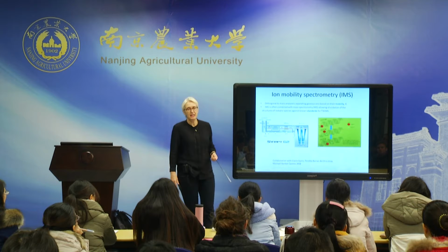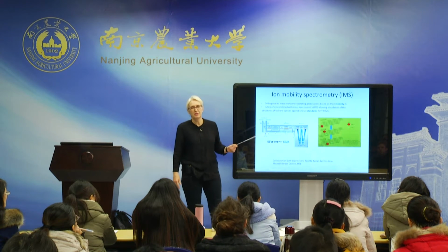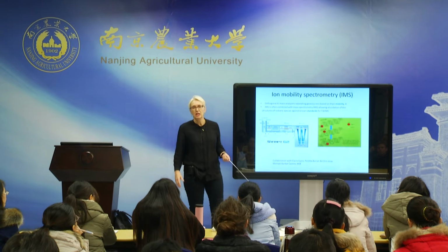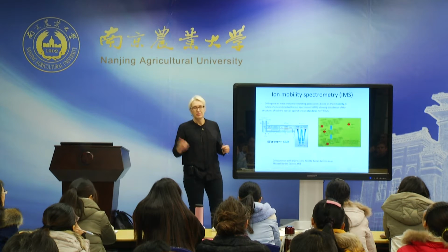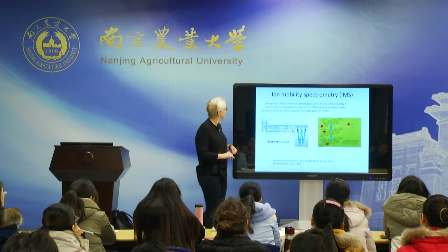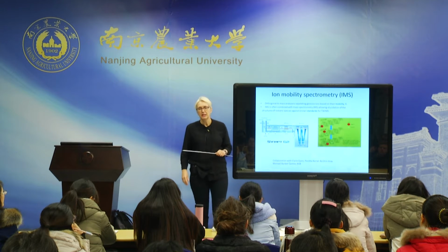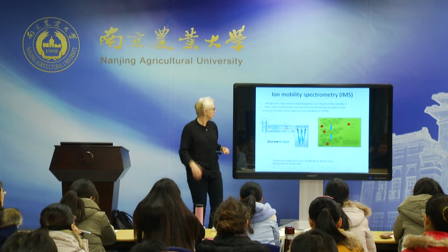She said, well, there is a technique which has been used for many, many years in mass spectrometry. It's been around for a long time. It's widely used. In fact, it's used in airports when you get your suitcase swiped for illegal compounds. They swipe it and put it into a mass spectrometer. It's actually not a mass spectrometer. It's called an ion mobility spectrometer.